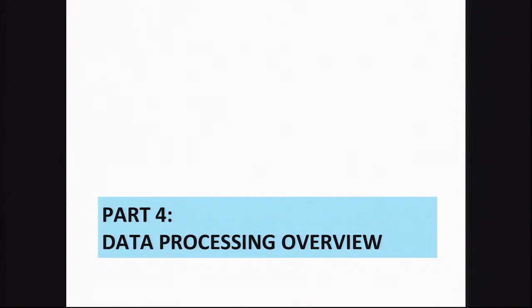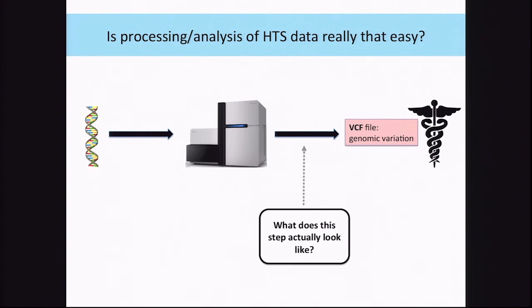All right, and how do we process these data formats? So, it seems like a relatively straightforward process. We have a sequencer that reads and gives quality for the reads. We have aligners that align and give qualities for the alignment. Based on all that information, it should be pretty easy at that point to figure out what is an actual variant and what is nonsense.